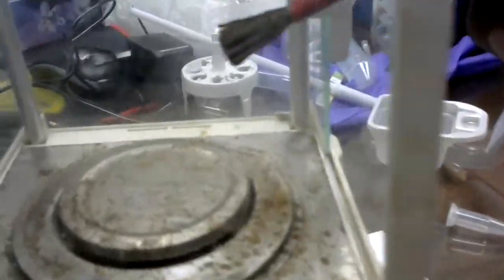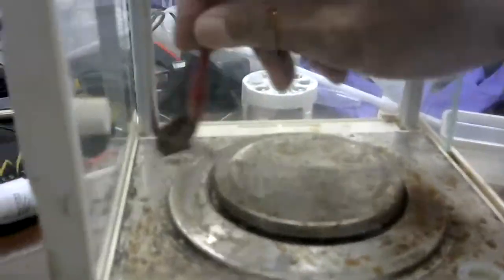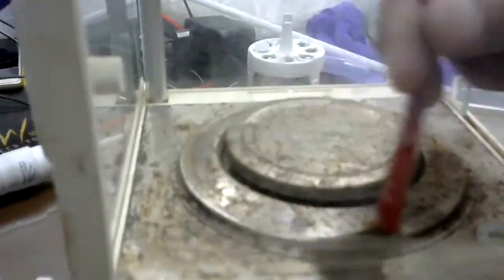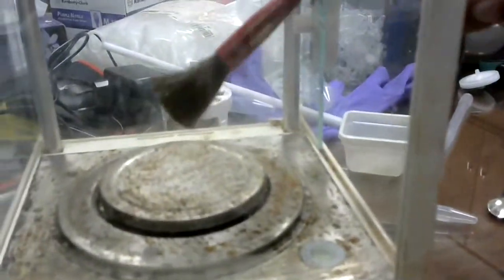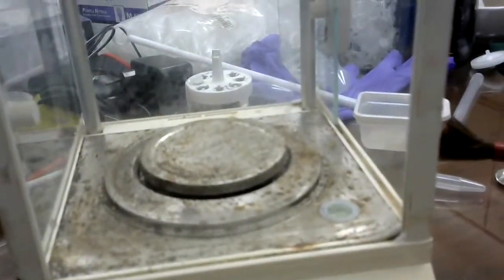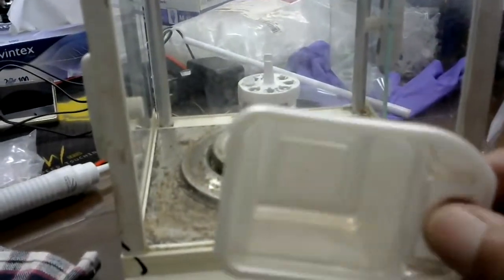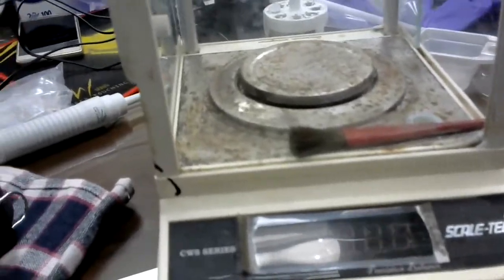While doing all these things, I might have made it dirty. Those chemicals might have fallen here, and next time if I weigh, all these things will be mixed up. So I need to clean it using this brush. Clean it and remove all the contaminating materials like this. So this brush should be available. Weighing boards of different sizes and types are also available, so those can be used.